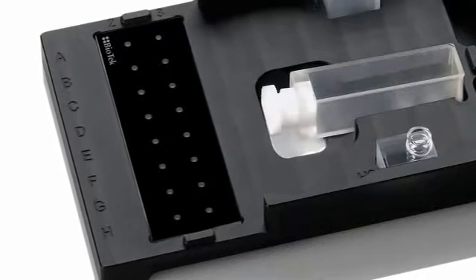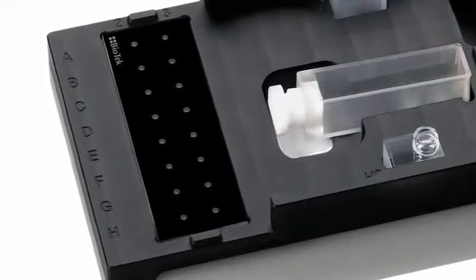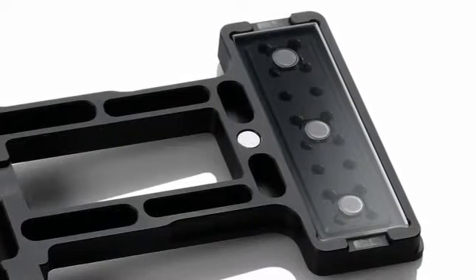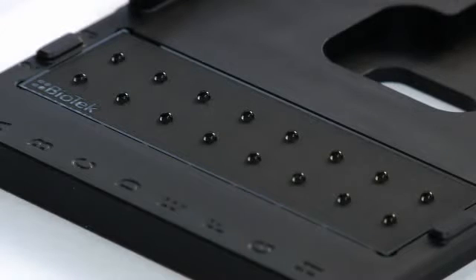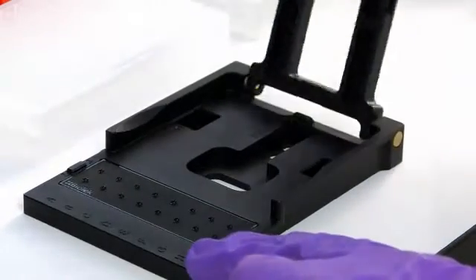The Take 3 plate has two uniquely designed fused silica slides mounted by magnets to the housing. The base slide is printed with Teflon to form 16 2-millimeter diameter microspots. The microspots are the ideal size for pipetting samples as small as 2 microliters.